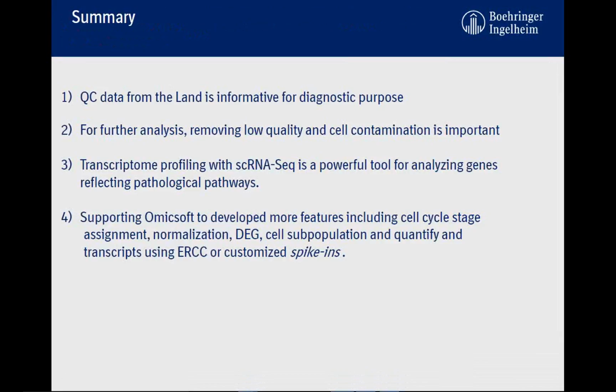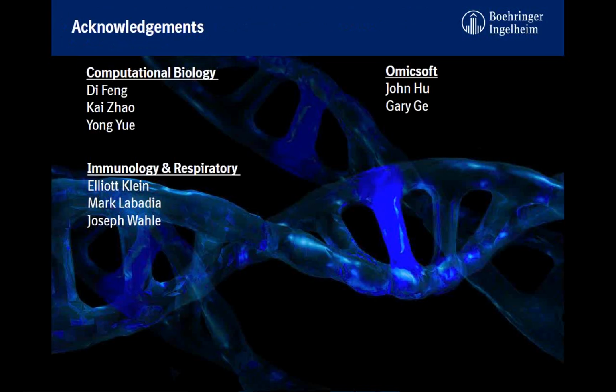And normalization methods, how we call the differentially expressed genes, how to automatically identify cell populations, and how to combine the power of the ERCC with your samples. And I think this is an early, exciting time for single cell RNA-seq. There's a lot of things we can learn using the published data. We know the advantages and disadvantages of the technology.